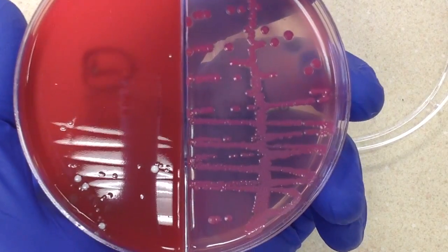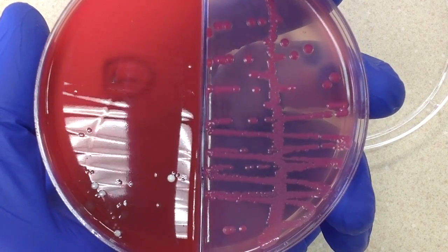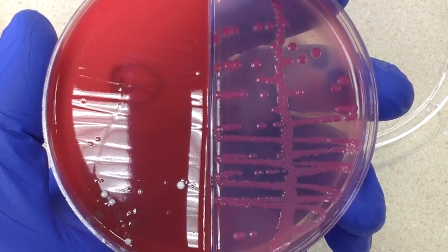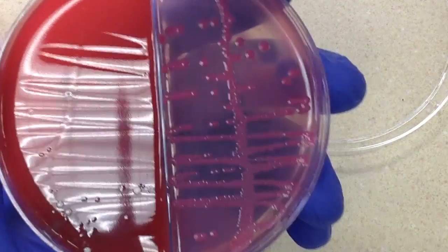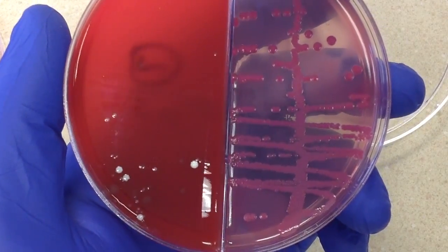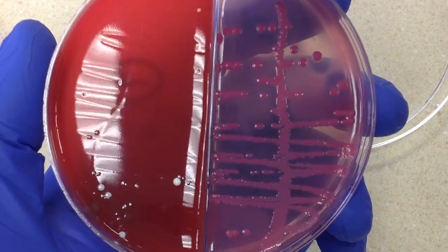So what this tells me is that this is a mixed culture. And in microbiology, there's kind of a general rule that has to be used with caution — you can't just blindly apply this rule. But basically, if there are three or more organisms or pathogens present, it's possible that you might not work it up.